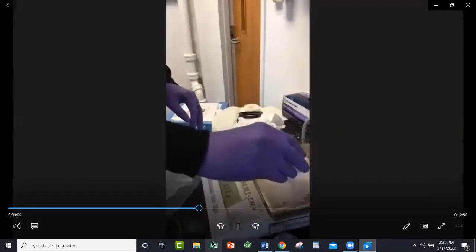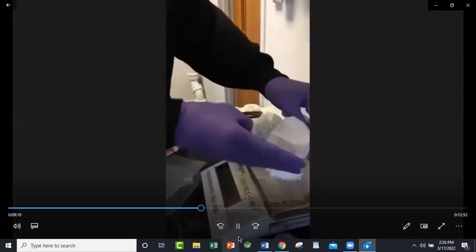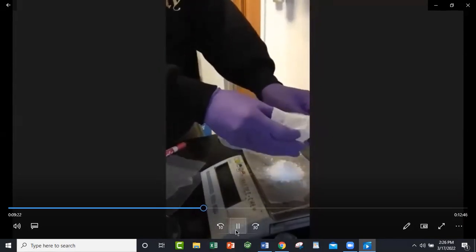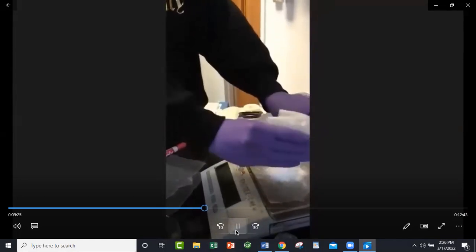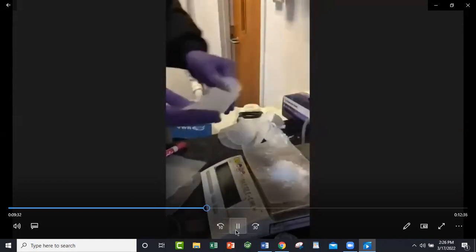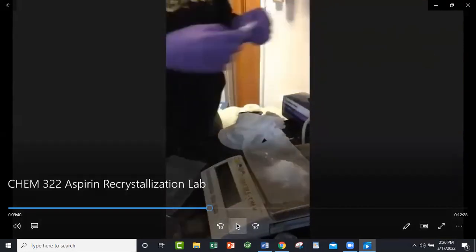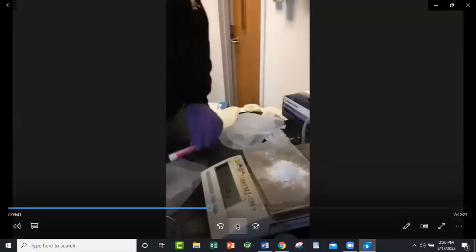Okay, this is the third sample. If you want to use this one, it's up to you. All right, so sample three is 7.27. If you want to use that number for your crude mass, feel free to use that. That's the third sample, so that's what you will write down. And we'll keep track of the amount of ethanol necessary to dissolve each one of those samples. 7.27.